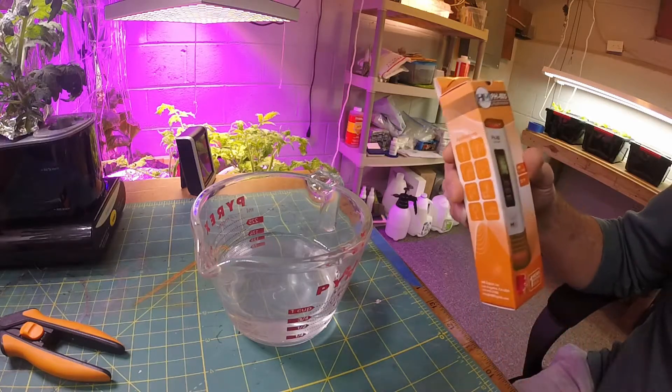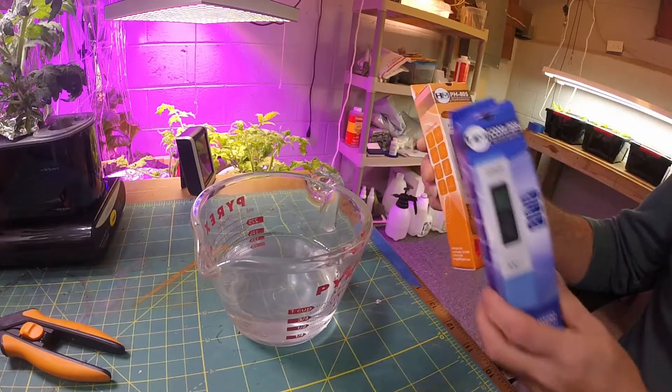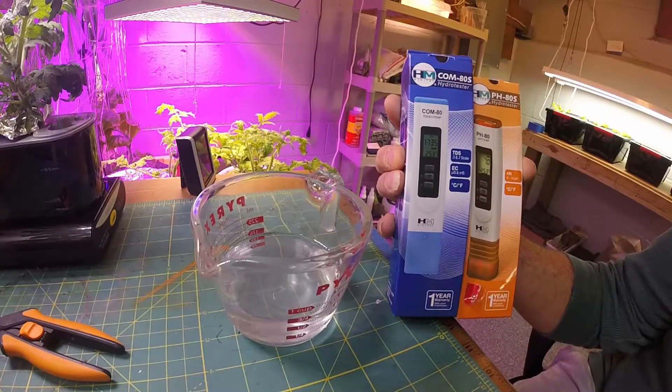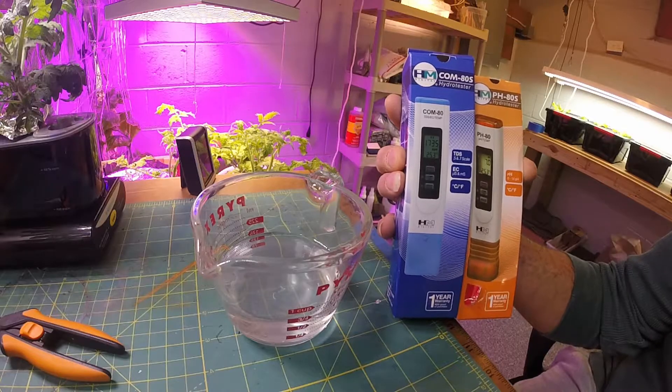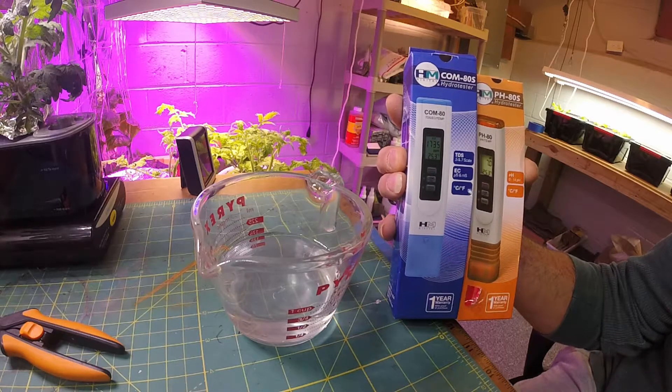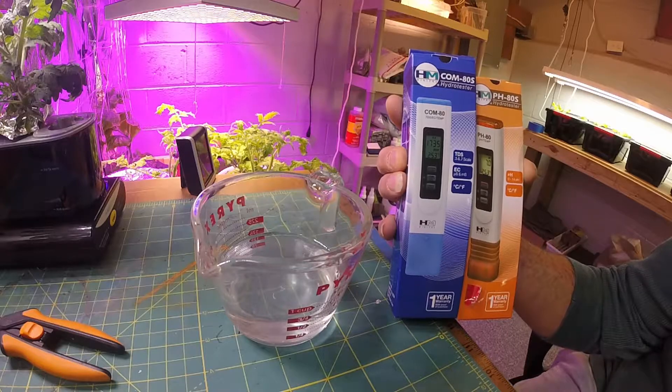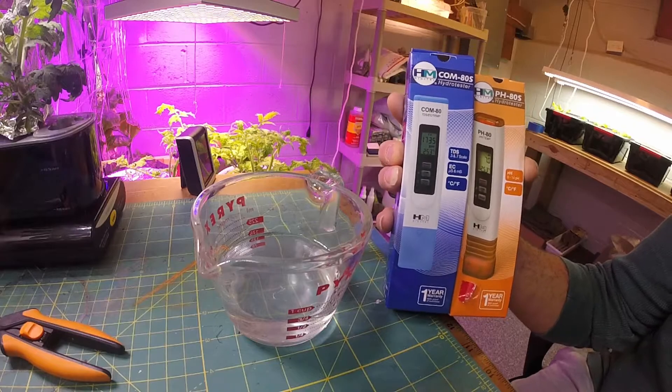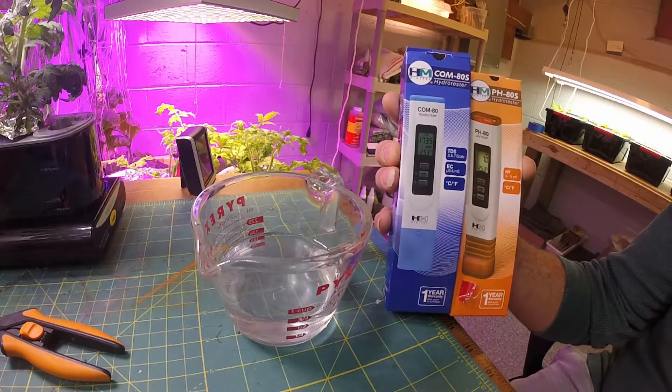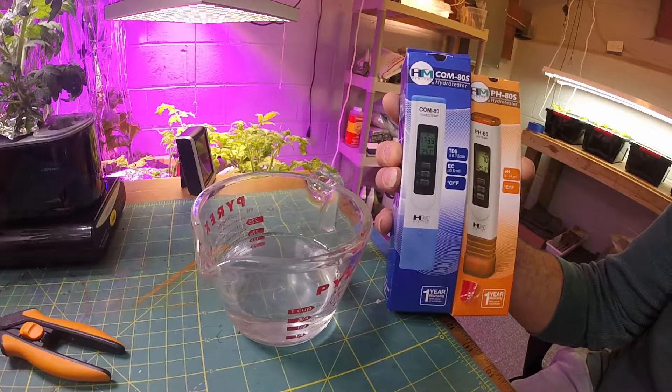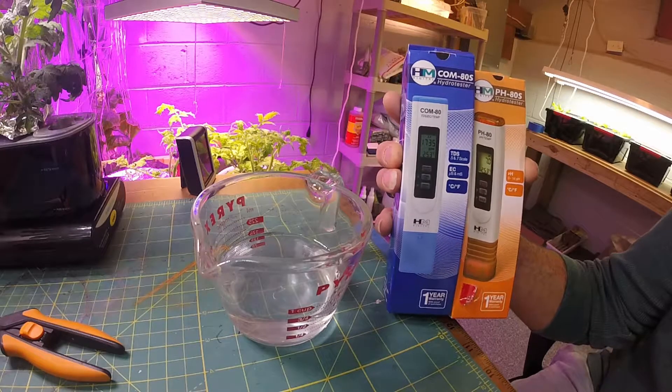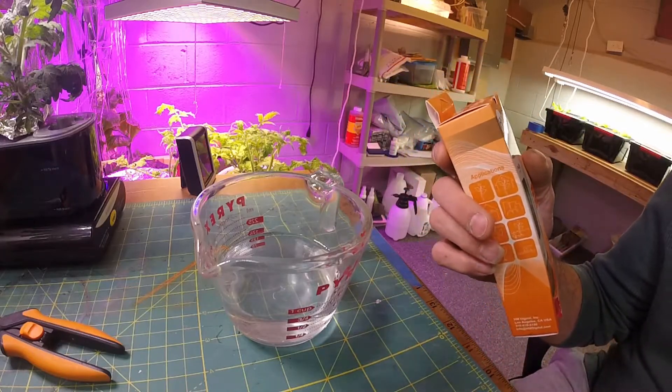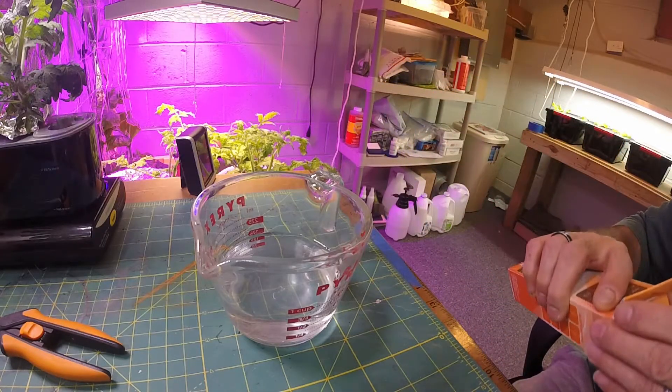Hey everyone, I must have been okay for Christmas because here's what we got - these are the H&M or HM digital pH and TDS meters. These are the ones that CB's Greenhouse and Garden recommends. I had some cheap ones, so I know he uses his all the time for everything. If he says they're good, I'm assuming they're good. These were on my Christmas list and I did get them.